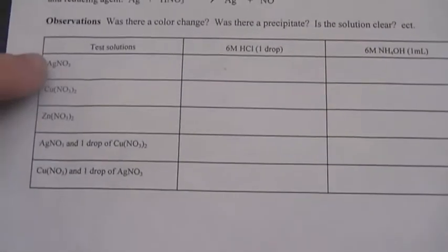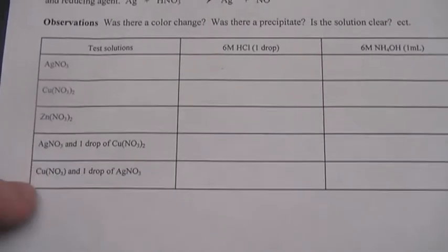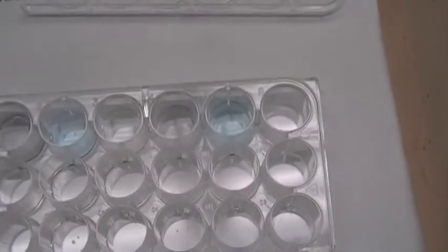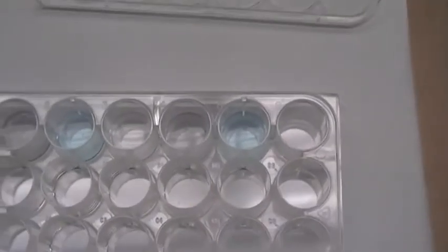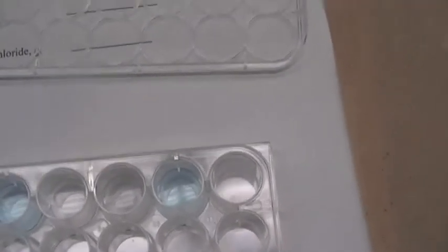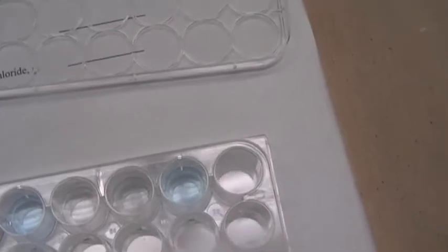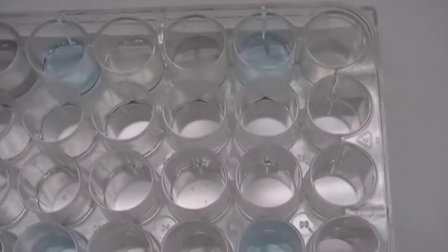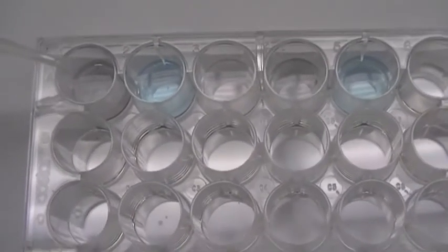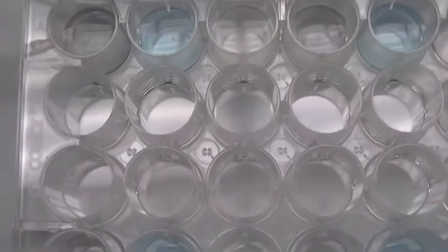This is 1, 2, 3, 4, and 5 as you go across the top, and that's 1, 2, 3, 4, and 5, and you can see where there is copper nitrate, which is a blue solution. We are to make our observations when we add 1 drop of hydrochloric acid. So this is 6 molar hydrochloric acid going into the first one, which is our AgNO3.